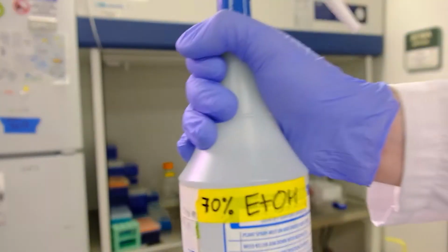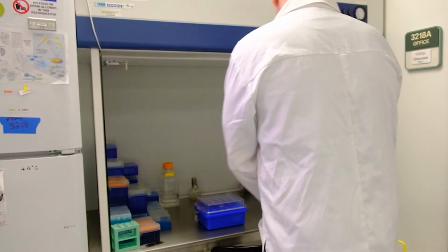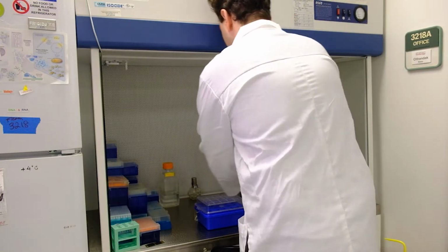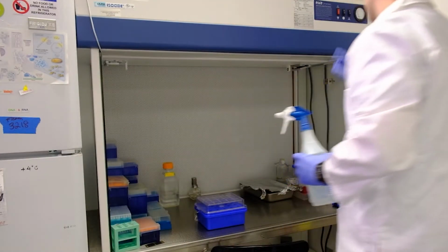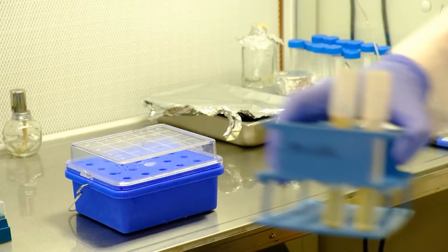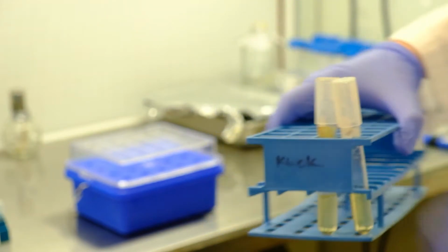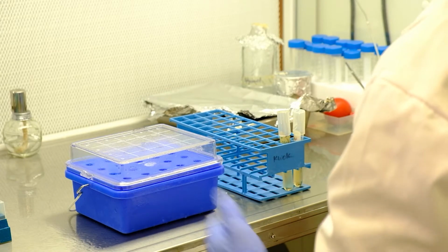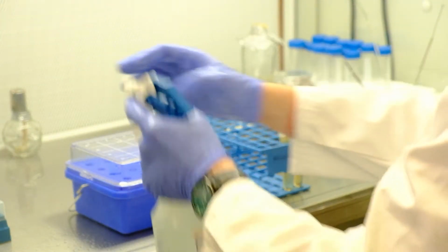Next steps will be performed in the laminar flow hood. Disinfect it with 70% ethanol before you start. Have your sterile media ready. We will be using 2 tubes of LB, 5 ml each. Anything that goes inside the laminar flow hood must be disinfected, including your hands, containers, and tools.